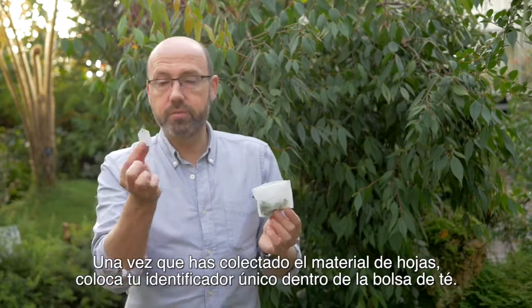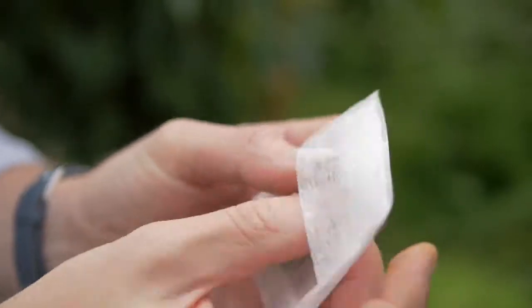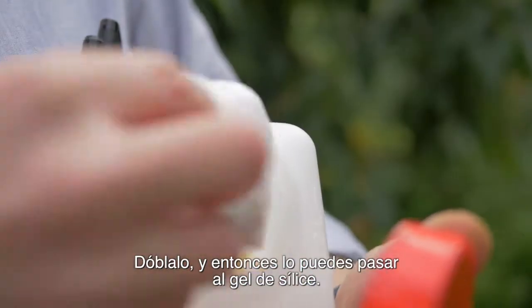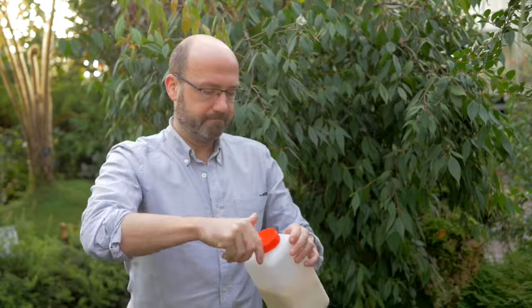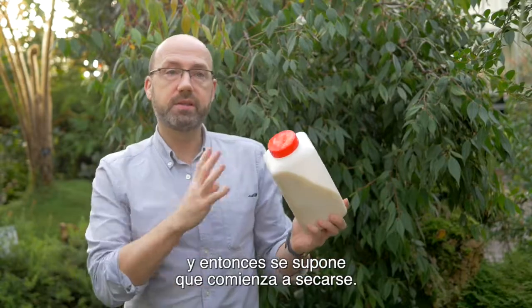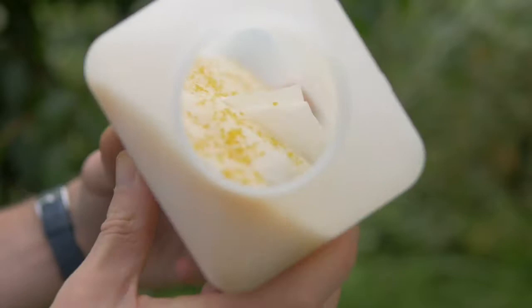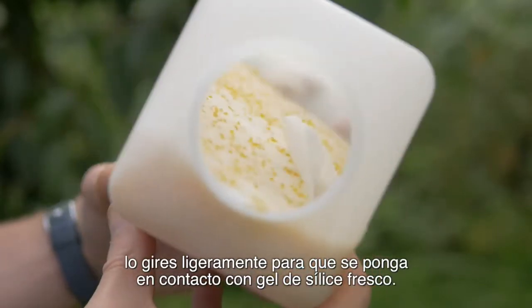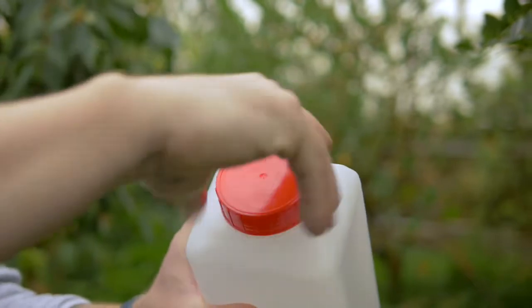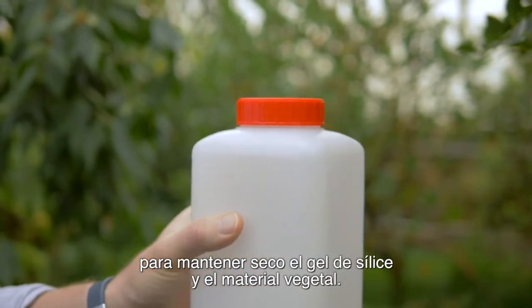Once you've collected your leaf material, put your unique identifier number into the tea bag. Fold it and then add it to your silica gel. Give it a good shake so that it has started to dry already. Once your tea bag is in the silica gel, it's important every hour or so to gently turn it so it's in contact with the fresh silica gel. When you're working in a humid environment, make sure you always keep the container tightly closed to keep the silica gel and the plant material dry.